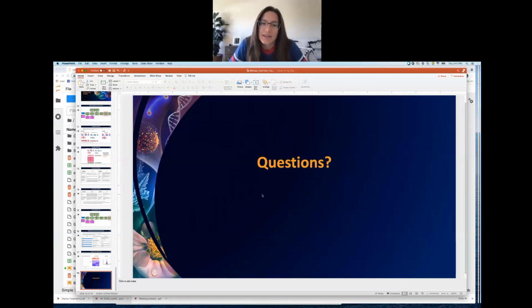One more question. From a biology standpoint, wouldn't differential isoform analysis be more useful than differential gene analysis? Good question, Felix. It completely depends on the question you're asking. If you have a gene in mind and you really want to know about the different isoforms, and different expression of isoforms has a different physiological effect on your samples, say an increase in isoform A compared with isoform B gives an increased likelihood of getting cancer, then that's something you're going to want to look at.